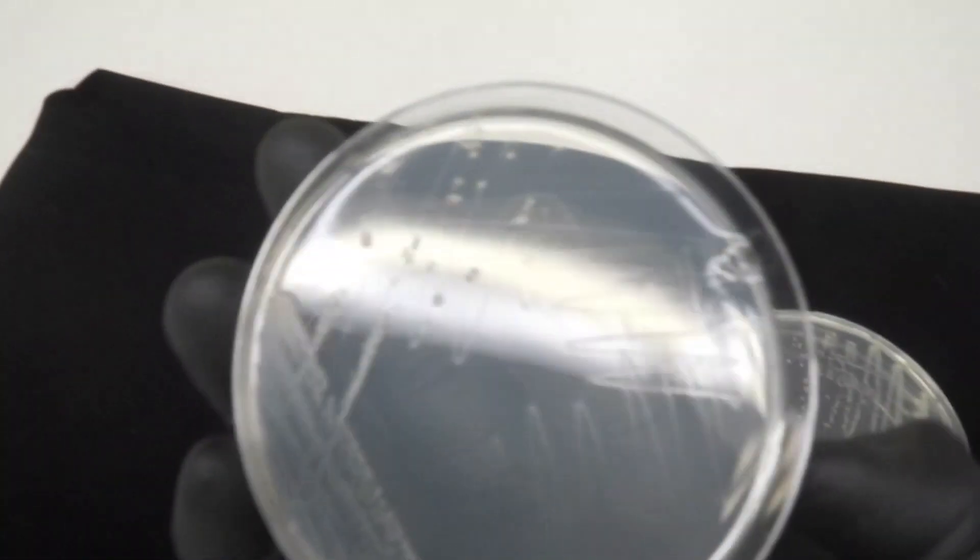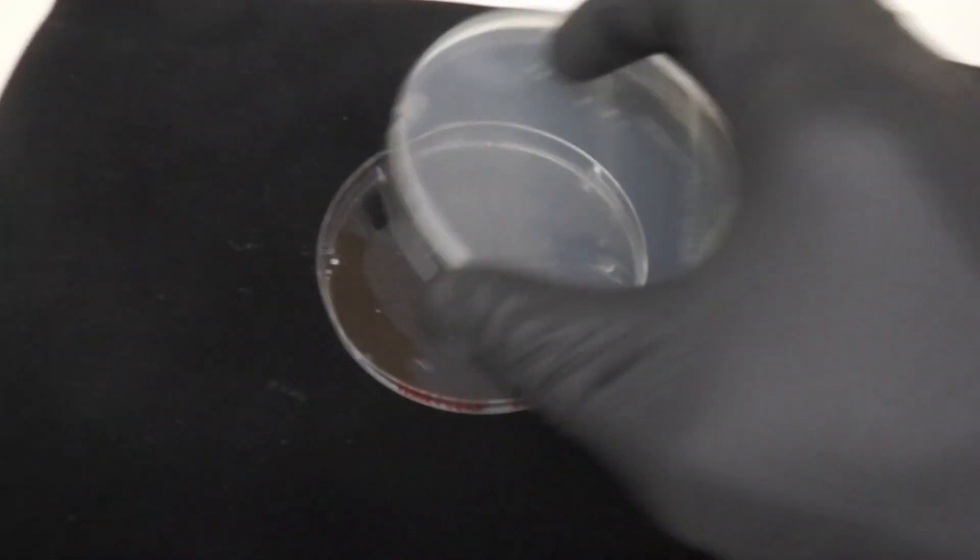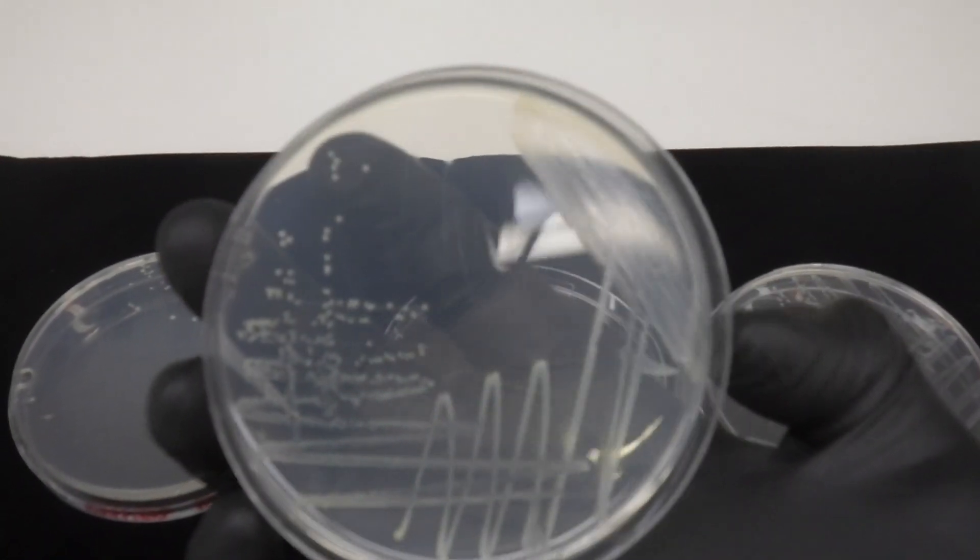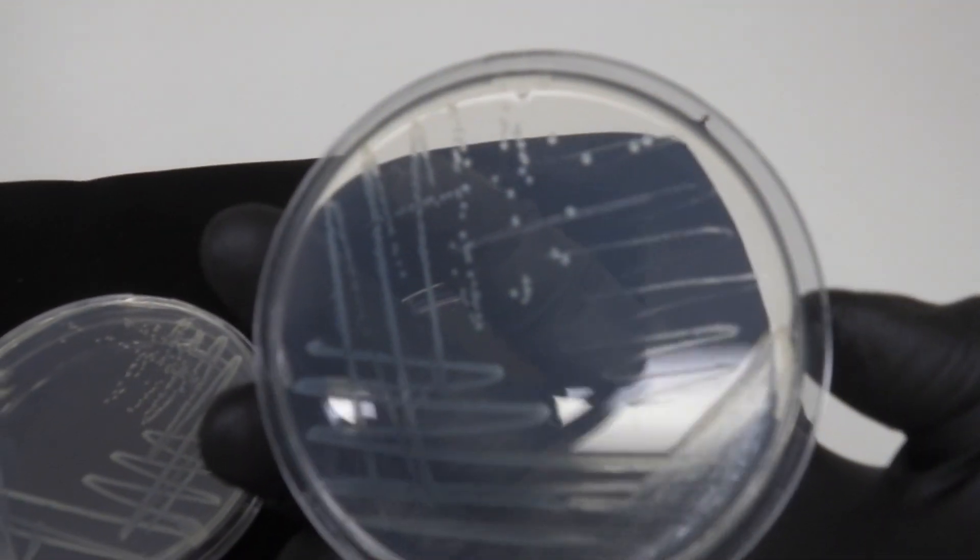On these three nutrient agar plates you can see colonies of Staph aureus and E. coli on the left, E. coli on its own in the center, and Staph aureus on its own on the right.